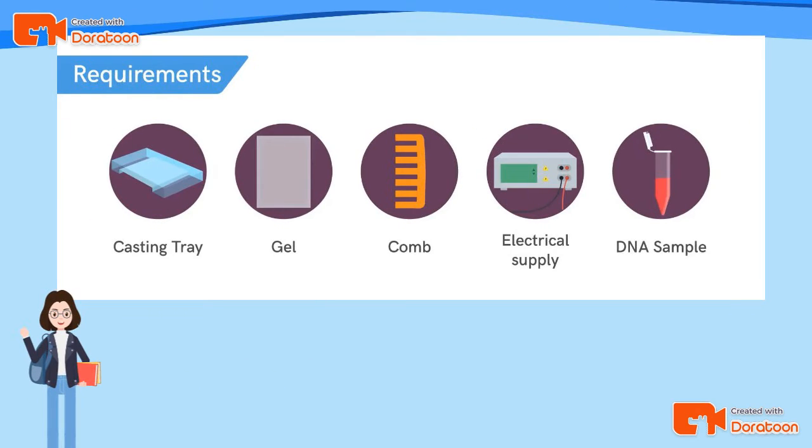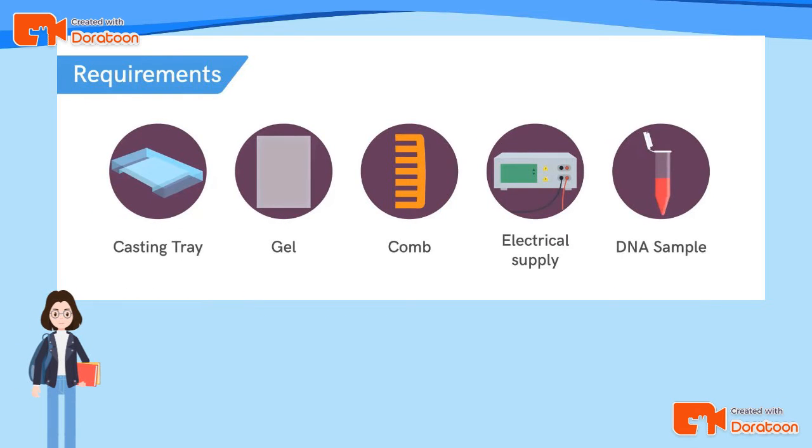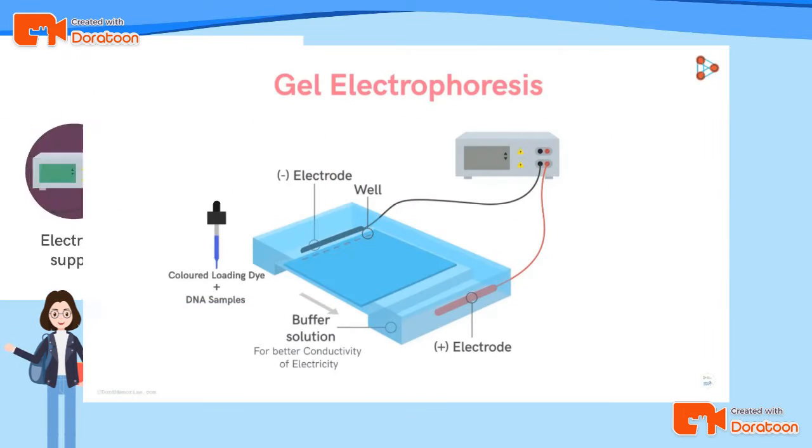Now let's get to the requirements for the procedure to work. The first one is the casting tray, containing the gel in which we will load the DNA sample, and next is the gel itself. Next is the comb for making wells in the gel. Next is the electrical supply, and the last one is the DNA sample with different sizes of DNA fragments.